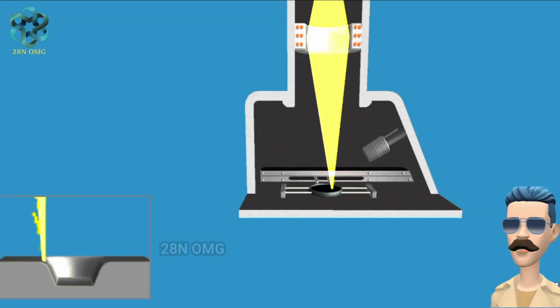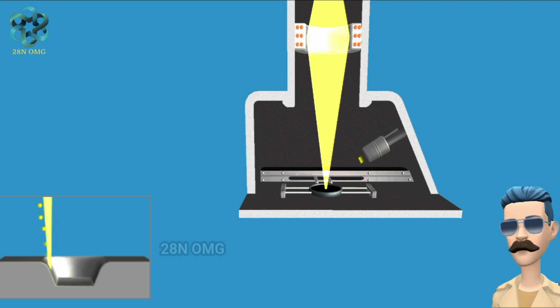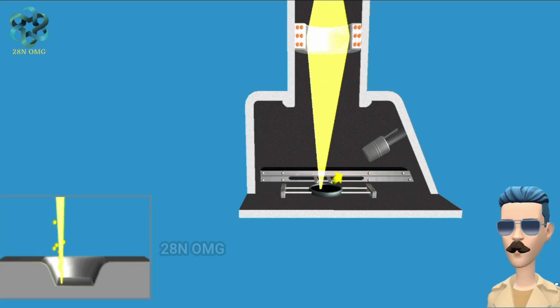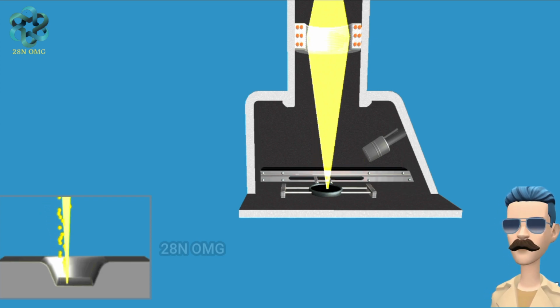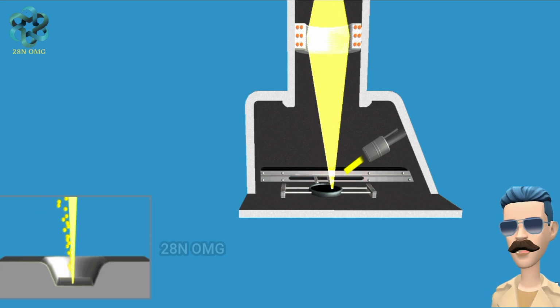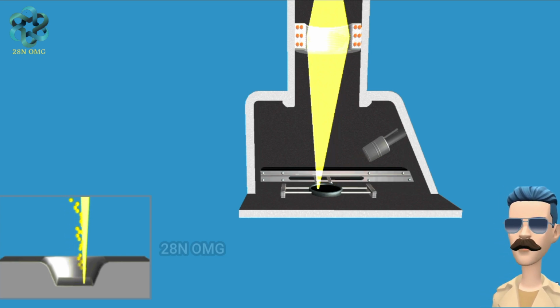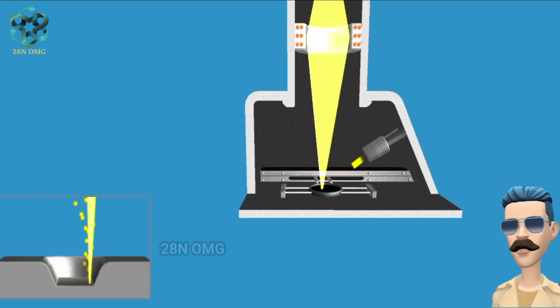Scanning electron microscopes create 3D images of the surface of the samples. The electron beam scans the surface of the sample via the deflection coil. The electrons reaching the surface may be reflected or may cause the emission of secondary electrons.